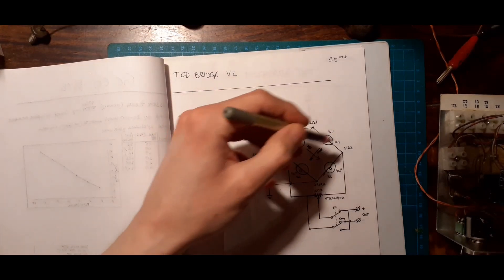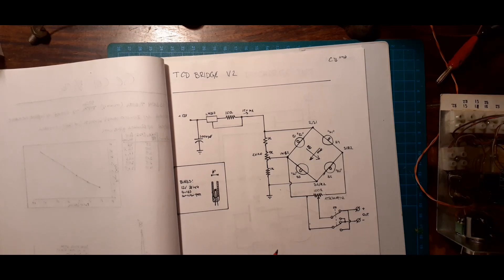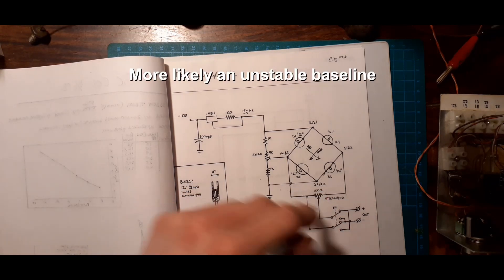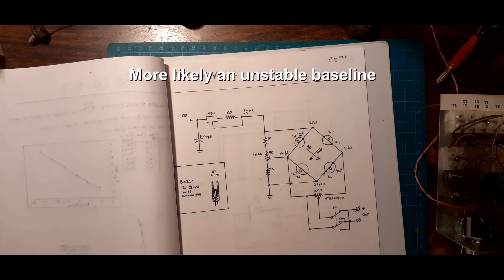You can make these bridges with both two and four elements. I opted for four elements, since if you have two elements, you'll replace two of these, one in each direction, with resistors, and you'll have to match these resistors. And of course any increase or decrease in temperature of these resistors will give a false signal of some sort, so that's unfavorable.